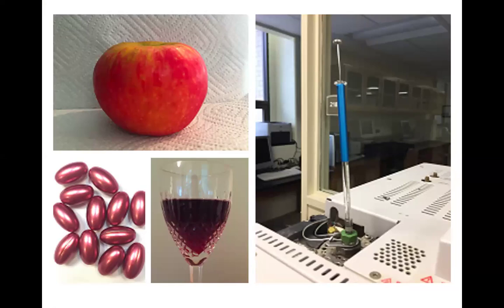You can use HPLC to do some analysis, but this is your actual sample. So how do you prepare from your actual sample into something, a prepared sample or suitable sample, for you to do analysis? In this case, you are to do GC, for example. So you are to do HPLC. So how do you prepare from this kind of real sample, actual sample that you obtain, into something that you can inject into the machines, or you can put inside some cuvette to do analysis? So extraction is more on sample preparation.